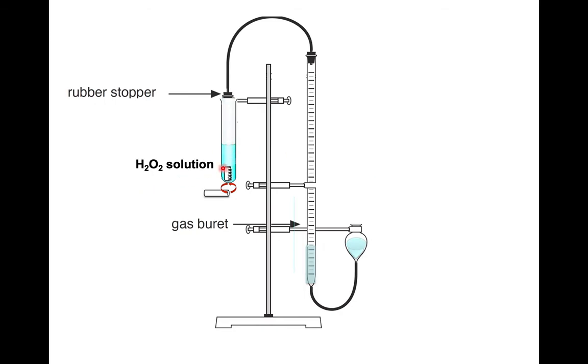Finally, you're going to have been stirring for a while. Eventually, you'll see no more bubbles formed. The volume won't change anymore. Then you want to get down at the level of the burette and ensure that the leveling bulb and the burette are exactly the same level. At this point, you can measure your final volume. And then finally, measure the temperature of the leveling bulb.